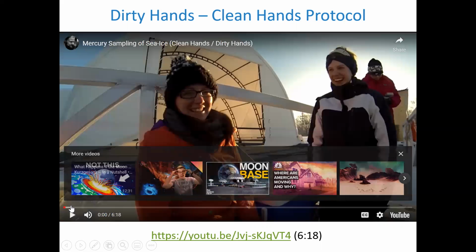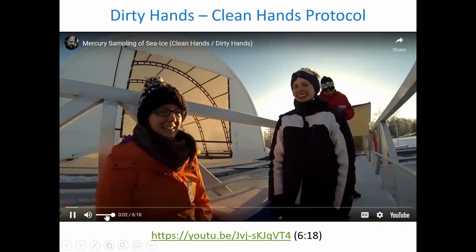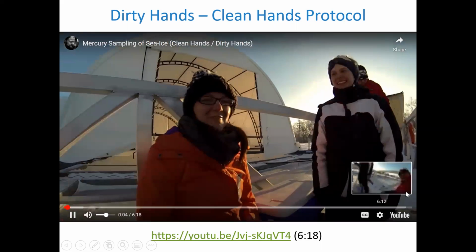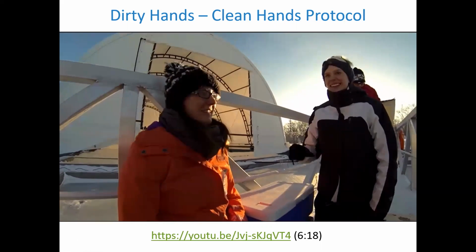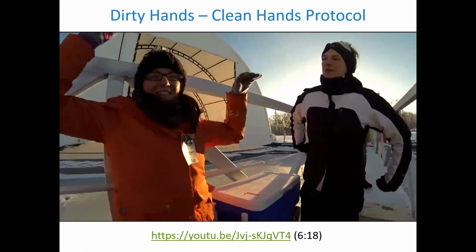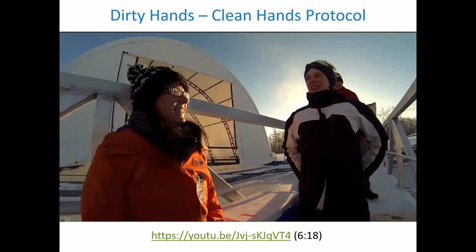Hi, I'm Amanda. And I'm Sarah. Today we're going to show you about clean hands, dirty hands sampling for mercury. Yay! Amanda, why do we do clean hands, dirty hands sampling?